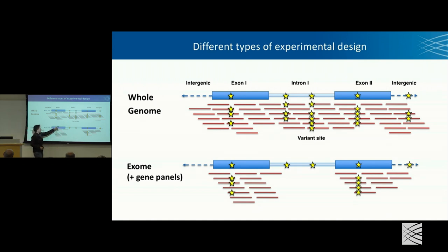In contrast, and here we're representing potential variants with these stars, when we're looking at exome sequencing, that gives us a lot less information. The sequence data is focused specifically on the exon segments of genes based on the annotation that you're using, based on the manufacturer's kits that you're using. They will have targeted specific regions, specific exons. A difficulty there is that depending on the targets list you use, you may or may not have coverage everywhere that's of interest, and you may not always have the same targets list as data sets sequenced by other people. And so when you're trying to compare exome sequences across groups, across institutions, that can get a little bit difficult.